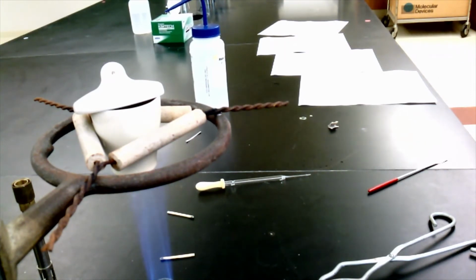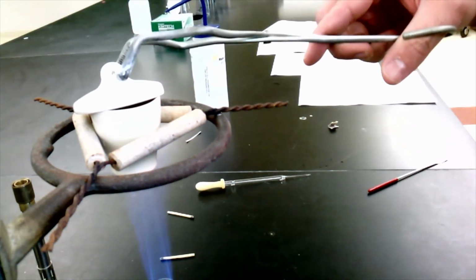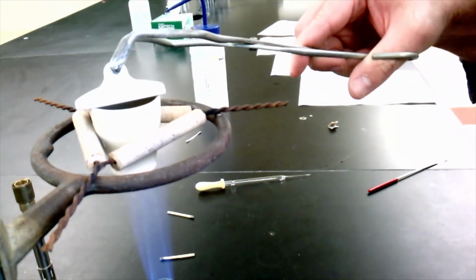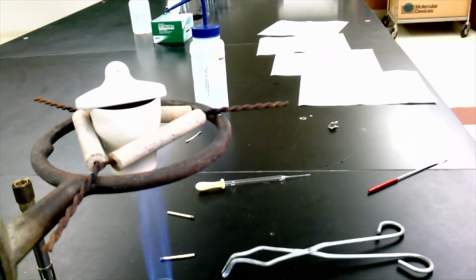So ammonia, NH3, is one of the things that smells really bad in some sorts of cleaning supplies. Definitely a really bad thing to mix with bleach. But it boils at an even lower temperature than water, so it's going to come off pretty readily when we heat this. So a few more minutes of heating, and then we will cut to the dried and cooled magnesium oxide product, and then we will weigh it.